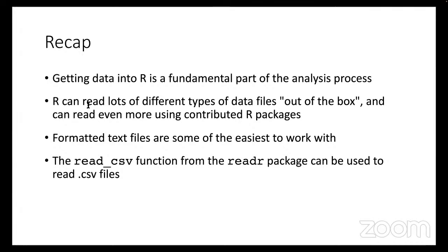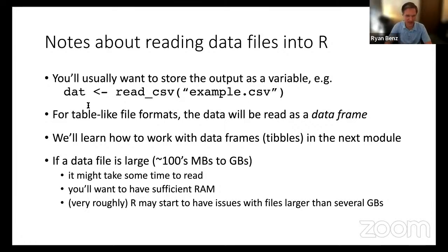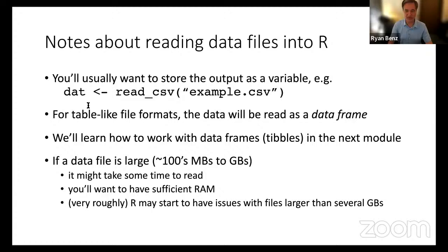Ryan, in terms of reading the data, here we are reading a CSV file. There was a question of reading a .raw file. How can we read those types of files in R? Great question. I think we're talking about a .raw file from a mass spec vendor format. Yeah, correct. That is more complex to do, mostly because those file formats tend to be proprietary in nature. That being said, I haven't done this in a while because I usually convert mass spec data to open formats like mzML. And there are other functions that can read those mzML files.